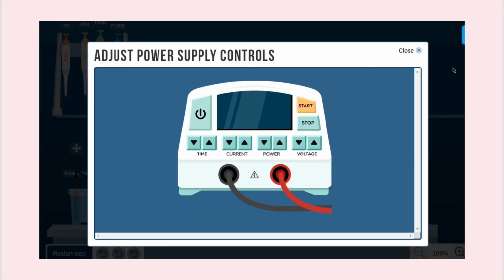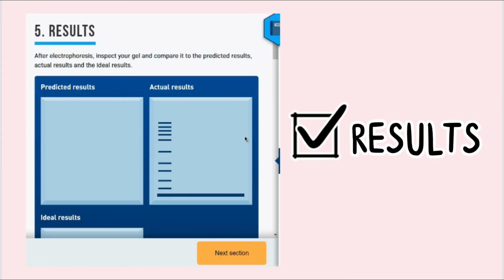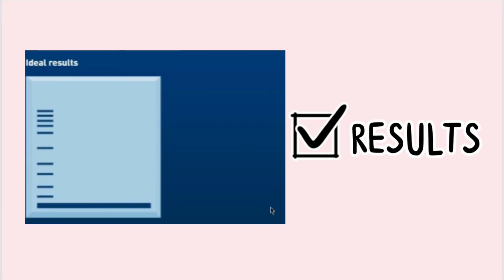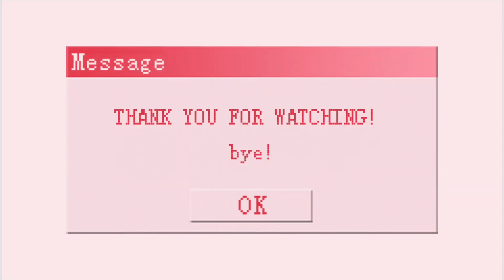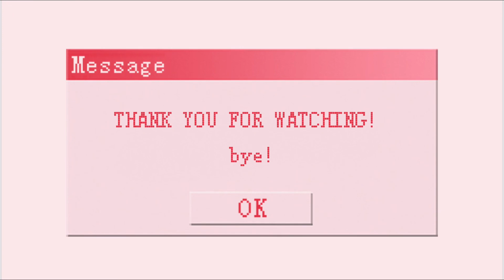And turn off the power switch, unplug the electrodes and inspect your gel. And that's all. So this is the predicted result and actual results, and also this is the ideal result. I think that's all from me, the virtual simulation of SDS-PAGE.